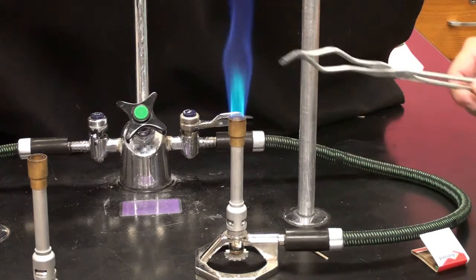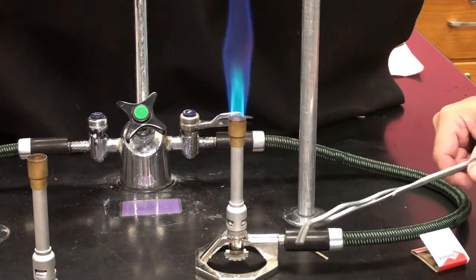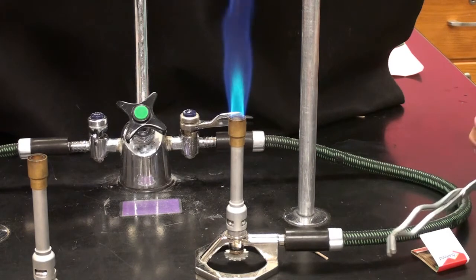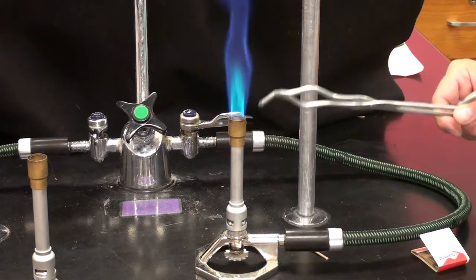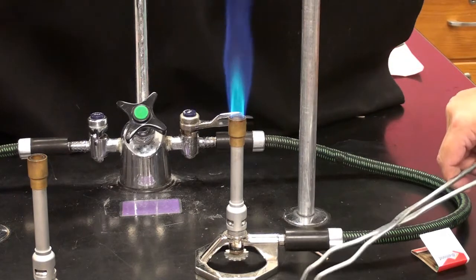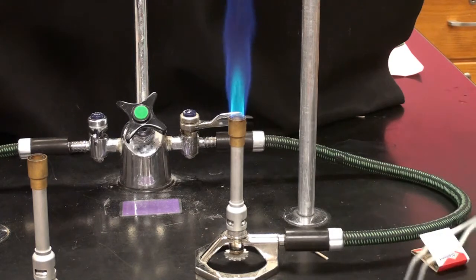So now we have a temperature range that we can estimate. Let's pretend that the aluminum melted at 500 degrees. If we looked up what the melting point of aluminum is and it was 500 Celsius, then we'd say, okay, that part below must be below 500, right? The part above must be at or above 500 to melt it. So we're getting kind of a range.